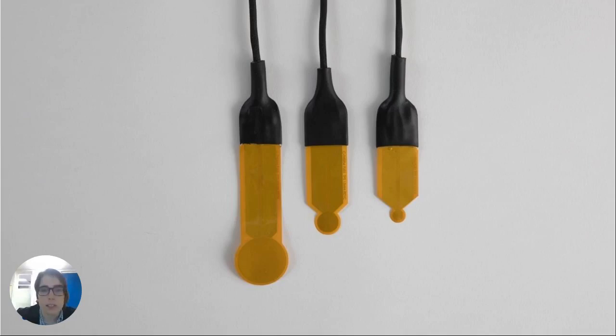And the largest sensor size there is 30 millimeters in diameter, and that would be appropriate to materials which tend to be highly heterogeneous. So, for example, if you were looking at a volcanic tuff with a lot of different sizes of materials that are consolidated into that tuff, that would be a case where the large TPS sensor might be the most appropriate.